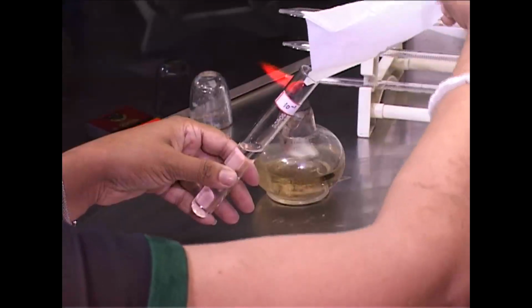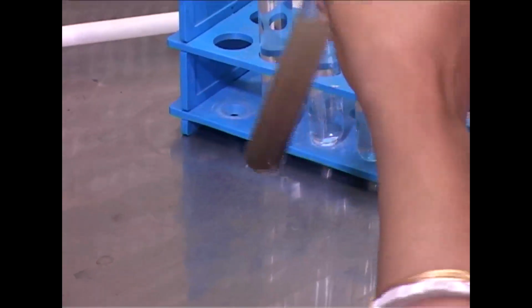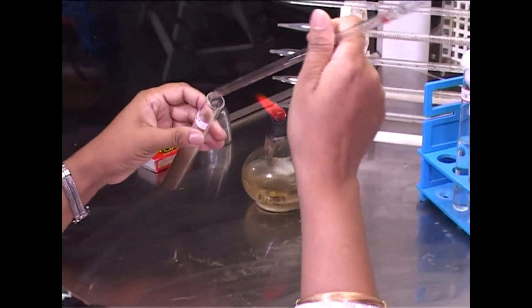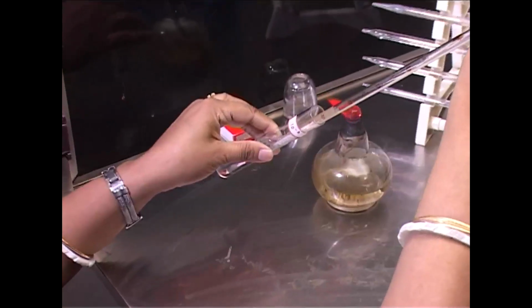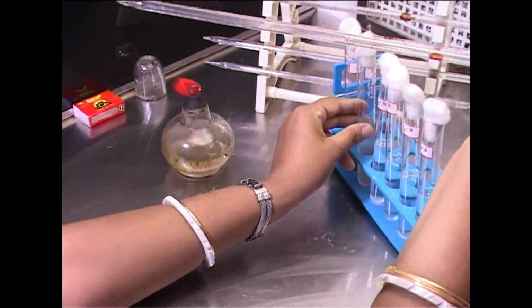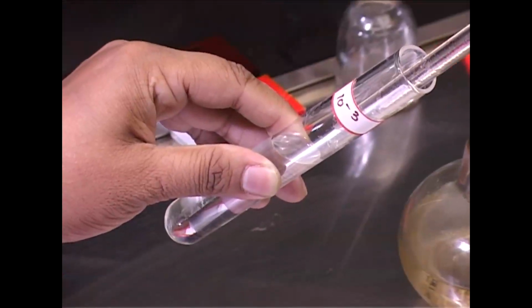So here we can take 1 gram of this sample and 9 ml of broth or sterile distilled water, which makes a 10 power minus 1 dilution, meaning it is 1 by 10 times diluted. Now if we take 1 ml from this and mix it into the second tube containing the same 9 ml, it will give another tenfold dilution, resulting in 10 power minus 2 dilution. Likewise, we can go from one tube to the next, making the sample more and more diluted. We can carry it out till 10 to the power minus 6 or 10 to the power minus 7. So this is the serial dilution protocol which needs to be followed with the soil sample.